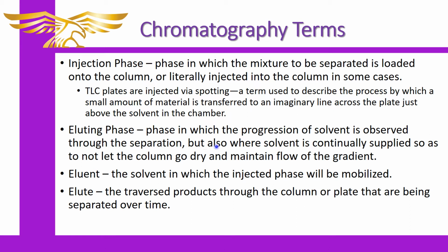And you can reuse columns if you set them up this way. As long as they're wet and they have enough solvent in them, you can use a column for several separations. Usually after about 5 cycles, you'll do a procedure to clean it, and you can reuse the media. The media is somewhat expensive, especially in biochem labs. Enough for 2 columns is probably worth almost $600 in some cases. So it can be quite expensive, and that's why we tend to clean and reuse the media if possible, because it's a lot of trouble to set it up, and it is a somewhat large expense.